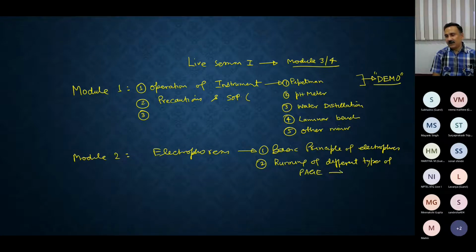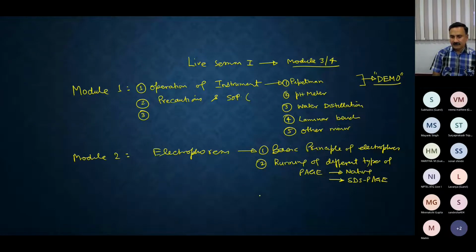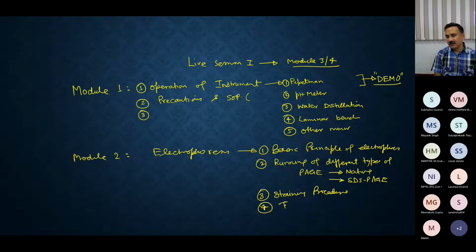So we discuss running the native gel and the denatured gel like the SDS page. We have also discussed the staining procedures, and at the end, in this particular course, we have also discussed troubleshooting. So there are specific aspects that we have discussed.